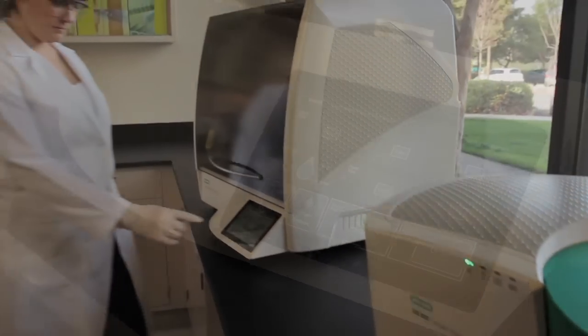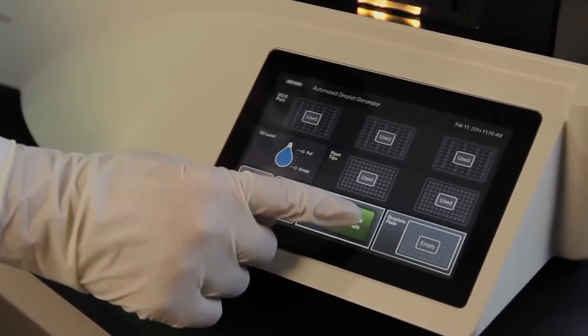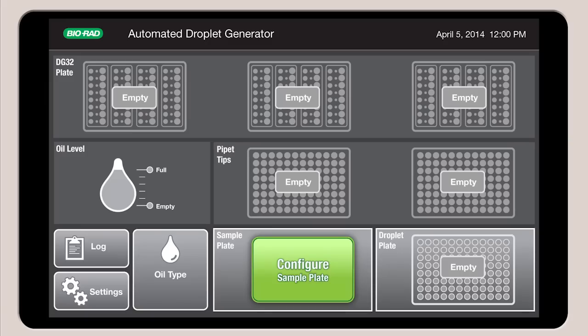Setting up the AutoDG is quick and easy. A large color touch screen provides an interactive map of the instrument deck that guides you through the setup process.